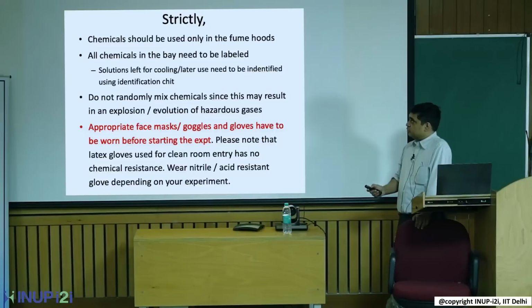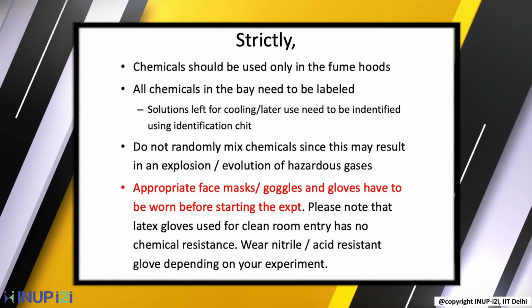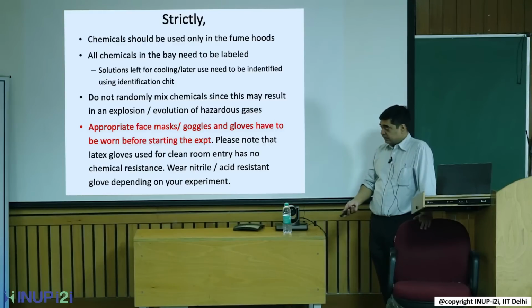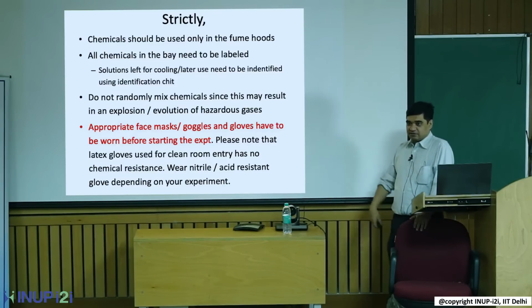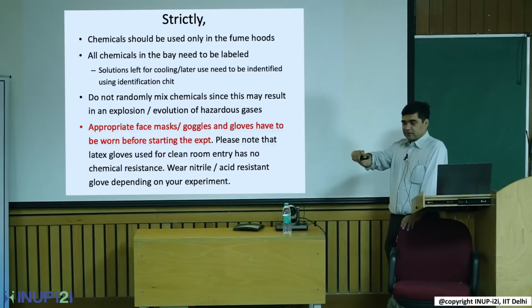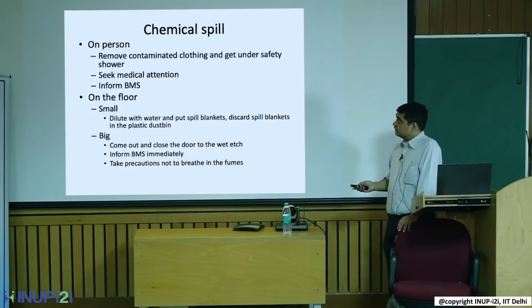Chemicals should be in the hood. Don't mix chemicals randomly. You have to know what you're doing. Wear appropriate gloves. Sometimes, how do you dispose of it? In our lab we have an acid waste disposal, so you can pour it down the drain, except for HF. Some chemicals you need to cool before pouring. In semiconductor processing, a lot of times we use Piranha, which is hot concentrated sulfuric acid, and you can't just dispose of it like that. You need to cool it. In that case, write it down on a sheet or something, so that the person coming after you knows what is there, right?